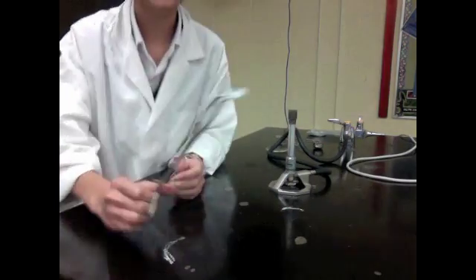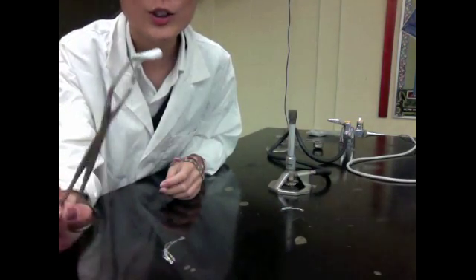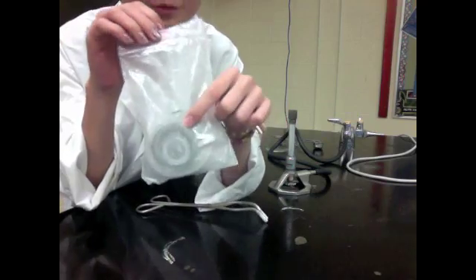We're also going to be using tongs, which is to grab the magnesium. Magnesium looks like this and it comes in the shape of a ribbon. So we're just going to be taking a little bit of that.